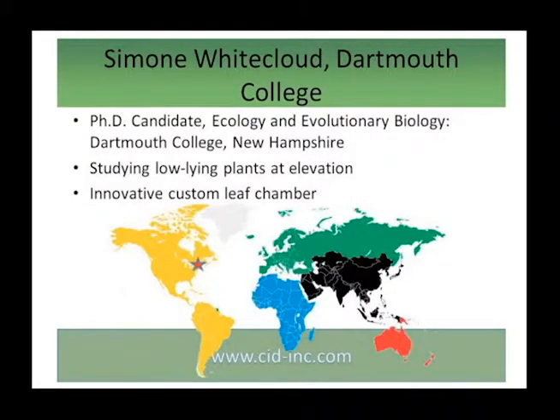So our next case study comes from Simone Whitecloud, who is with Dartmouth College. She is a PhD candidate in Ecology and Evolutionary Biology. And she's studying low-lying plants at elevation. And she has an innovative custom leaf chamber.